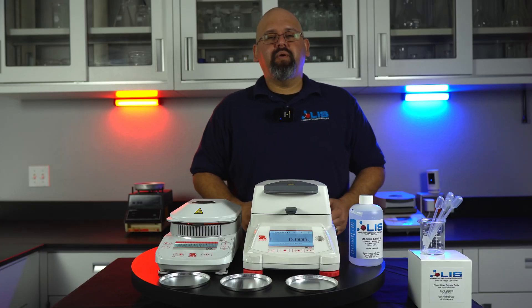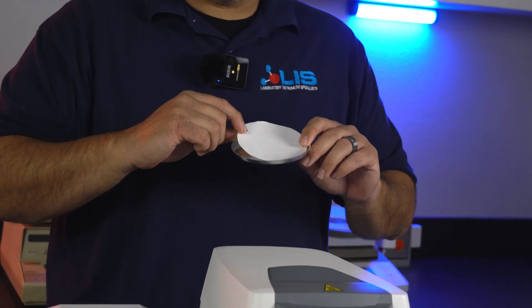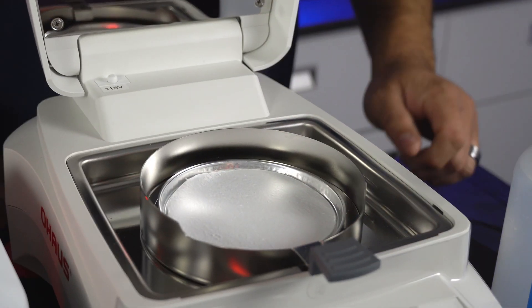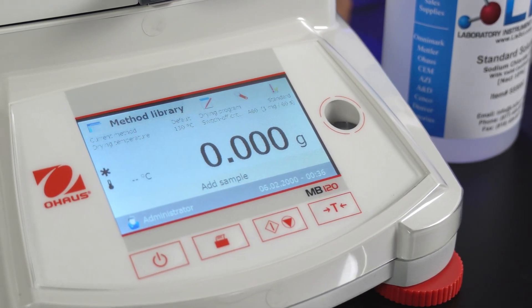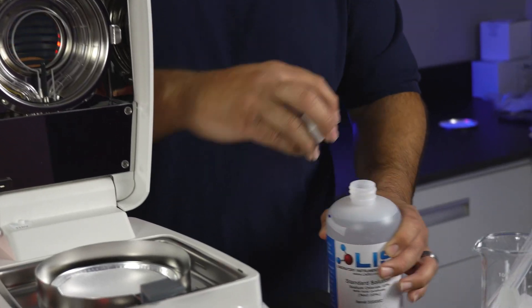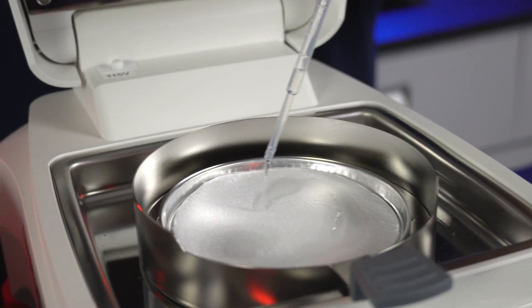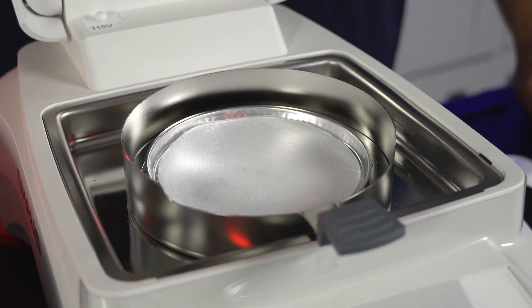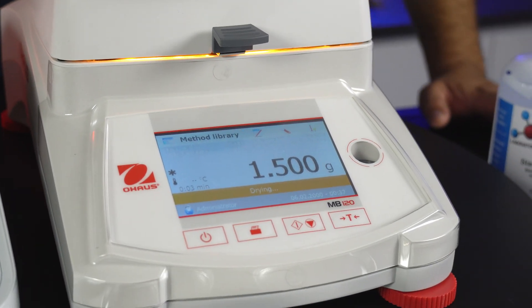Now we will be testing on the MB-120. You will need an aluminum dish and glass sample pad. Apply the sample pad on top of the aluminum dish. Open up your lid and insert the aluminum dish and pad on the center of the balance. Close the lid. The MB-120 has an automatic tear feature — as soon as you close the lid, it will zero out the aluminum dish and sample pad. Open up the lid and apply your sample. For best results, please distribute the sample evenly on the sample pad. When done, close your lid and it will automatically begin the test.